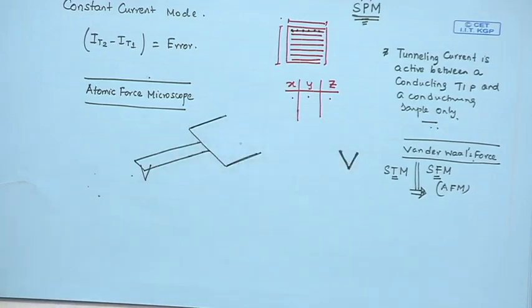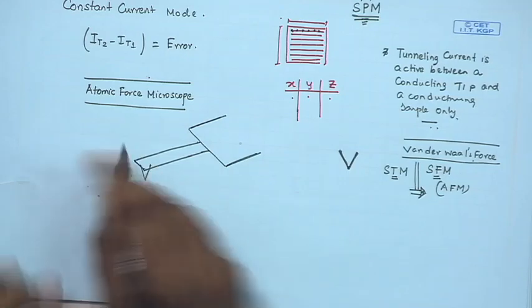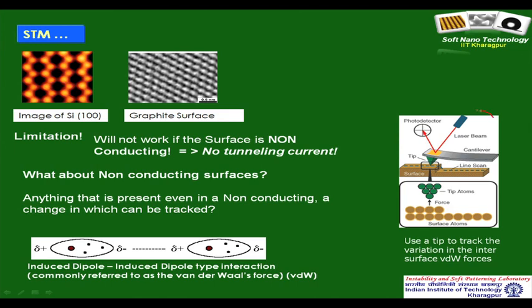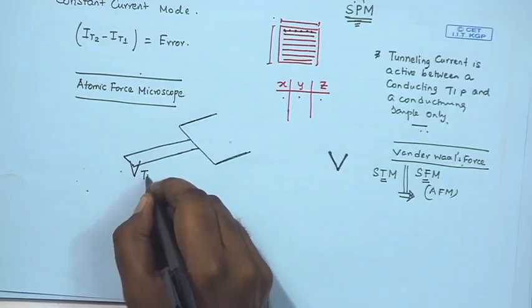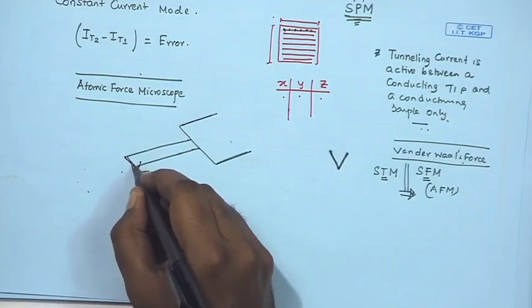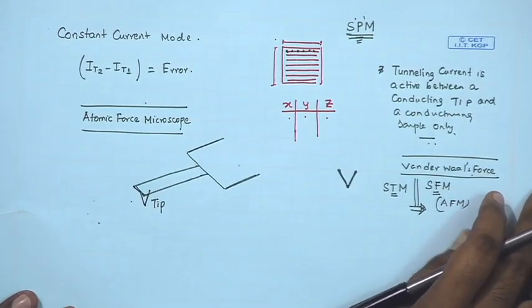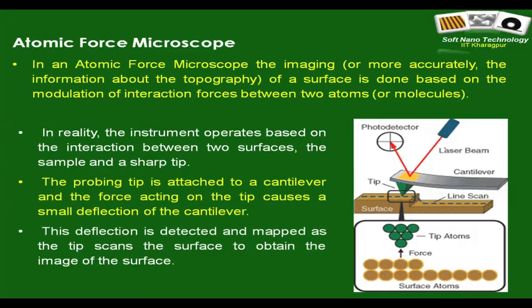This chip can be physically touched, but AFM invariably, I am sure that if you have tried to search some literature, you must have seen this picture. So, this AFM has a tip, but that tip is mounted to a cantilever. What is the utility of this tip and cantilever is something that we will try to understand.